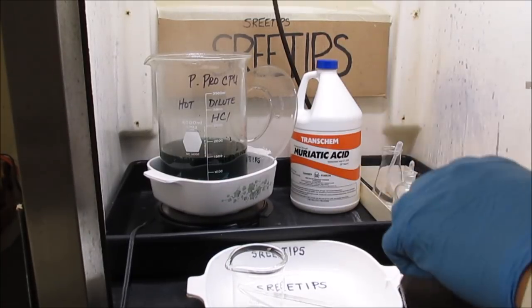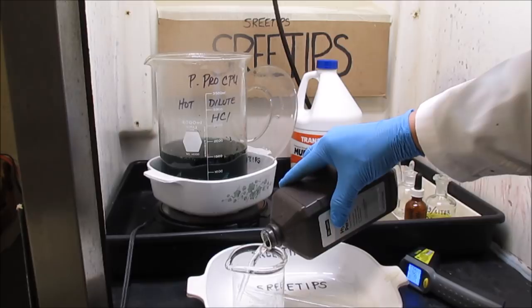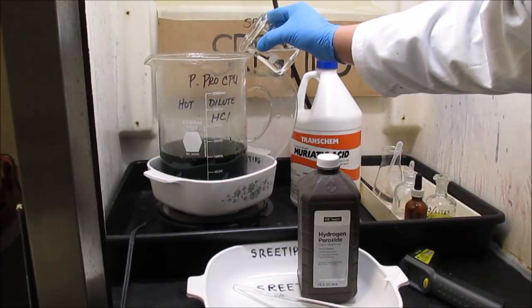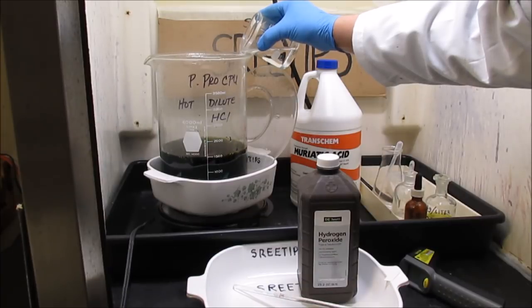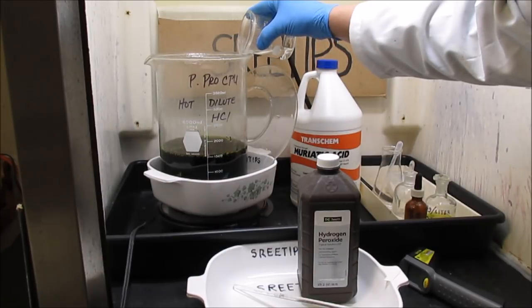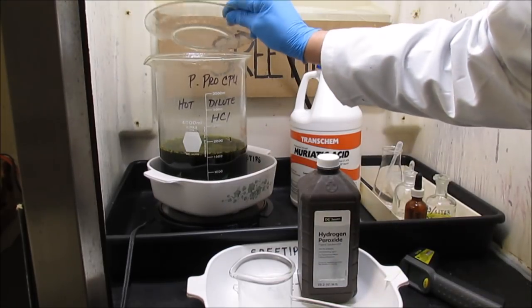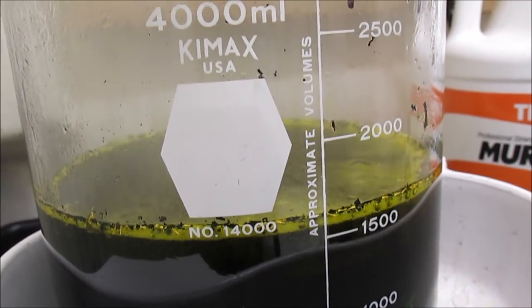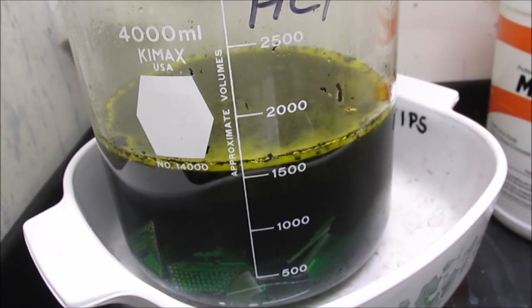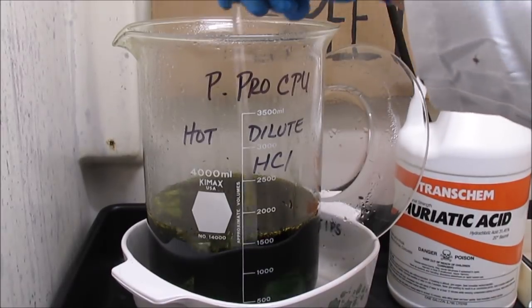What I'm going to do is add another 100 ml of 3% hydrogen peroxide from the grocery store. Add it real slow here. Give it a quick stir here.